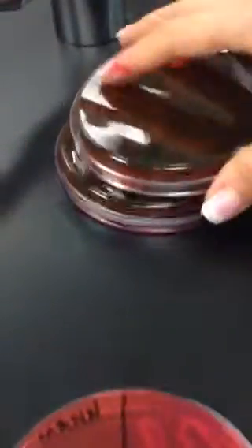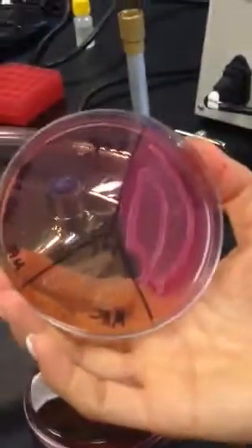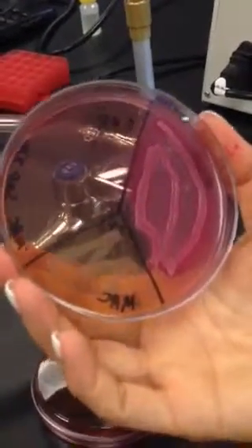The EMB agar specifically can be used to identify or rule out E. coli. If your unknown is shiny green, like your E. coli on the tri-plate of EMB agar, you probably have E. coli. If it's not shiny green, it's not E. coli. On your MacConkey agar, this also determines lactose fermenters and non-lactose fermenters. If you get a strong milky pink, it's a lactose fermenter. If you don't get that color change, it's a non-lactose fermenter.